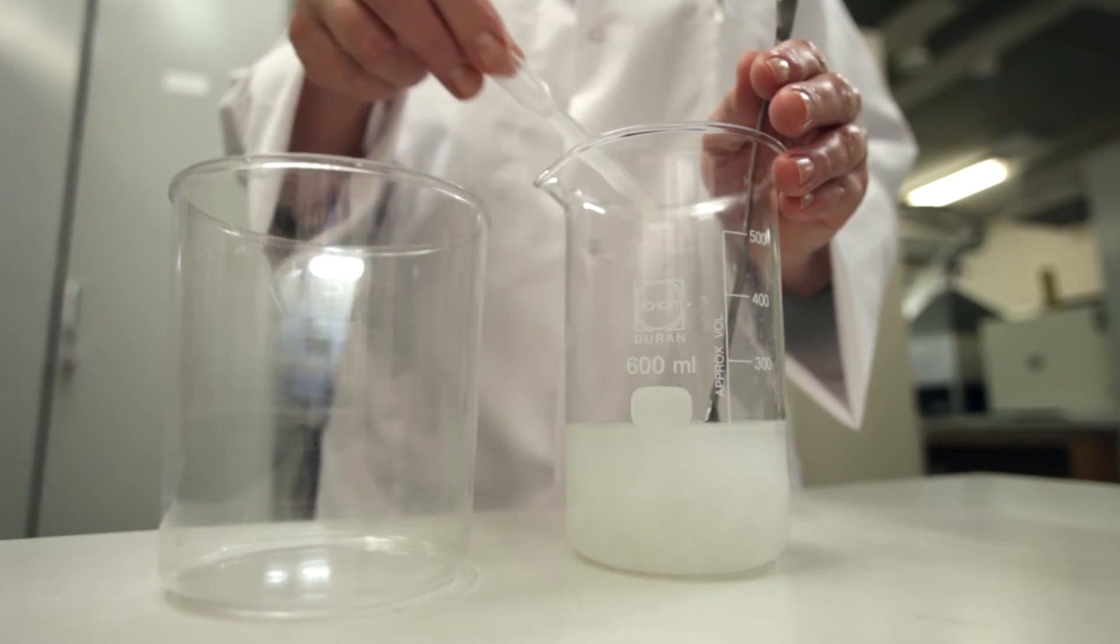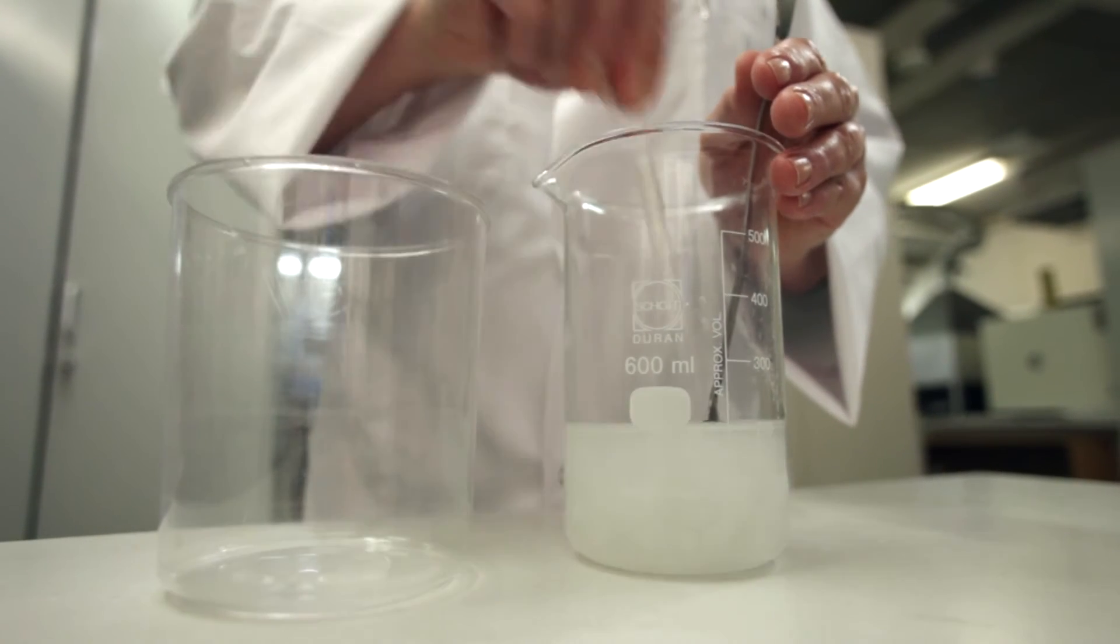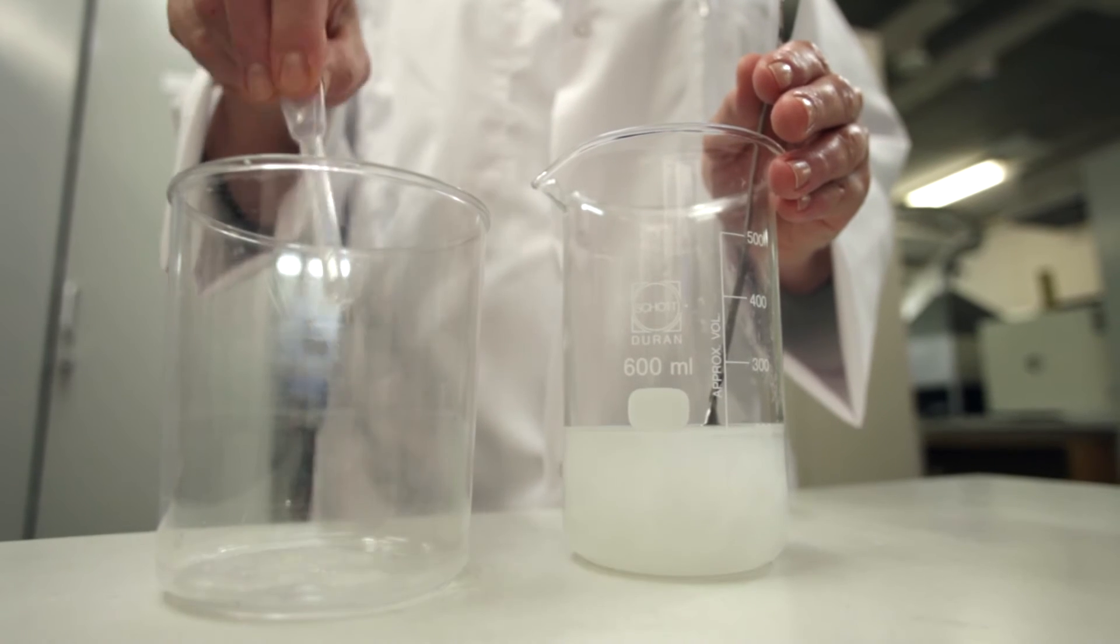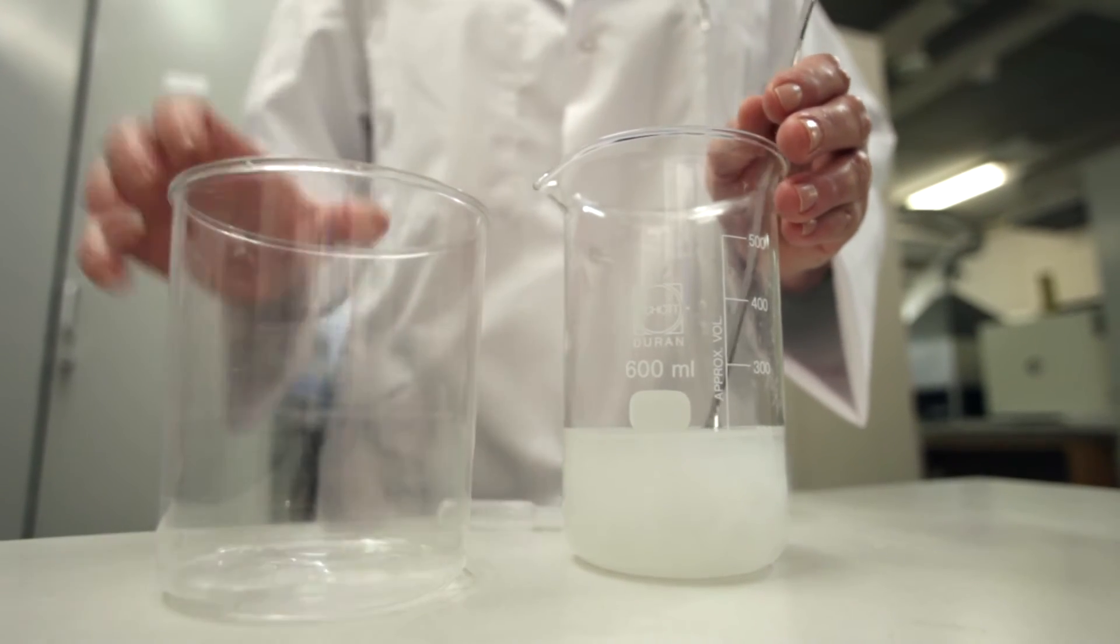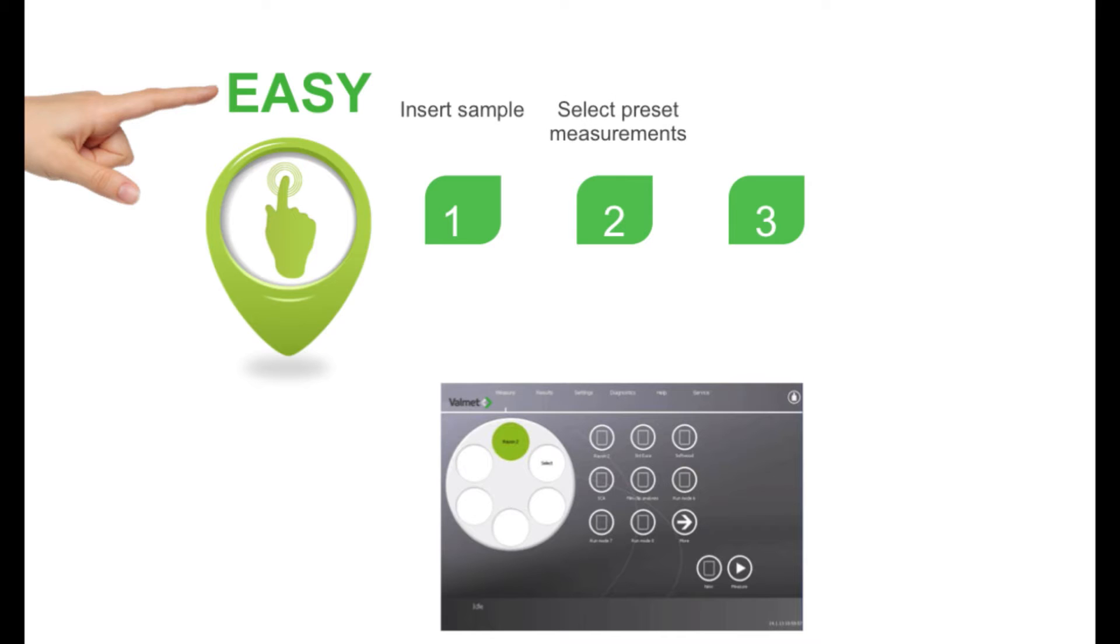The FS5 is so easy that anybody can use it. Results are just a few steps away. The automated consistency adjustment takes care of the step in the process in a fraction of the time compared to doing it manually.